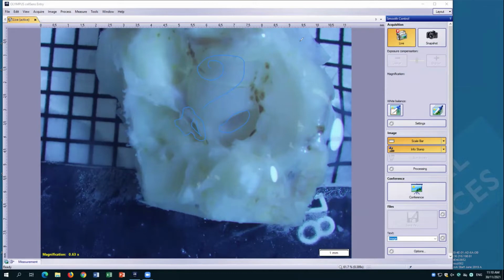What the fixative does is cross-link all the proteins together into a sort of solid state. So the structure is preserved. Protein localization, if done well, is preserved. But the tissue dies as a result. So what we have here is a dead cochlea with structure and a number of proteins fixed in place.